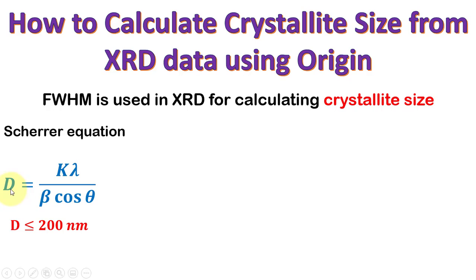In the Scherrer equation, D is the crystallite size which is usually calculated from the most intense peak in the XRD pattern. However, calculation from one peak is not suitable. We will calculate the average crystallite size from all peaks and then average those crystallite sizes.